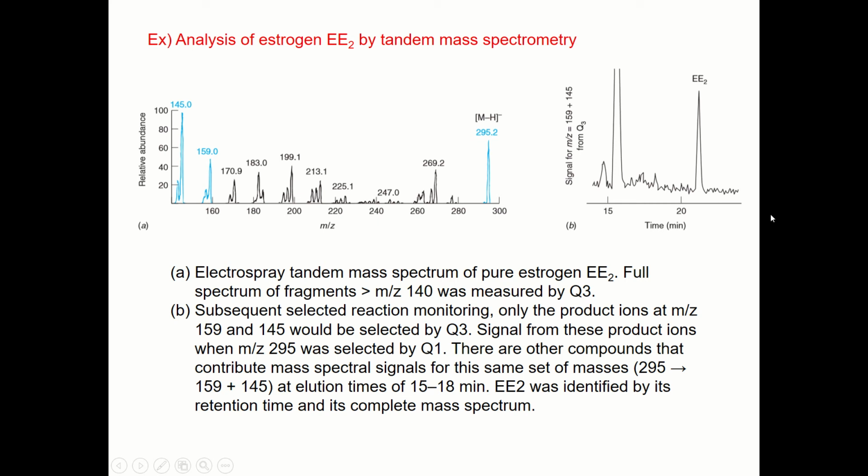This one is the estrogen, EE2. This is your real peak, but the x-axis is time. This QQQ tandem mass spectrometer is connected to a liquid chromatograph.